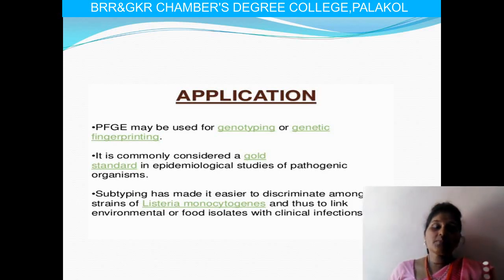Here we can observe clinical manifestations during separation, and also environmental contamination in food caused by Listeria monocytogenes. These are the major applications of PFGE.